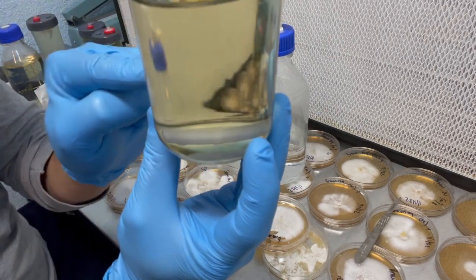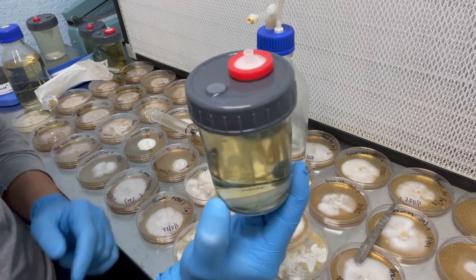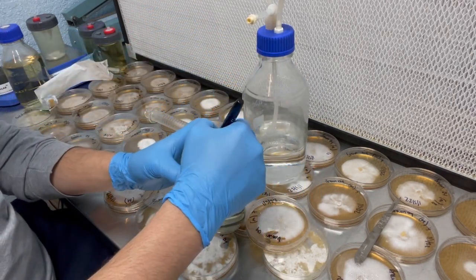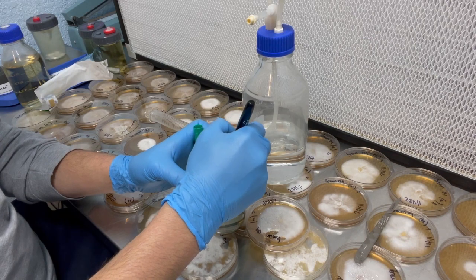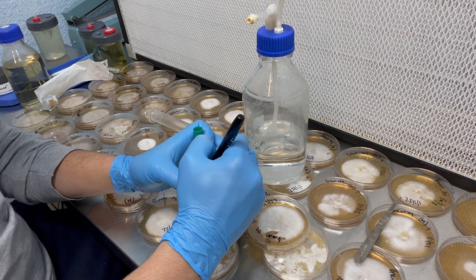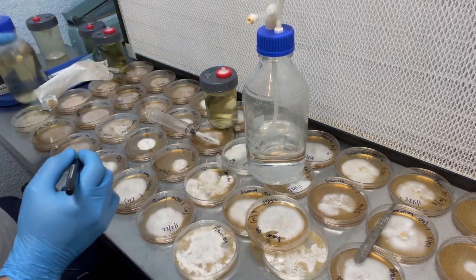You can see it floating around right here in the solution. I'll go ahead and label that — brown oyster number seven — and add today's date.